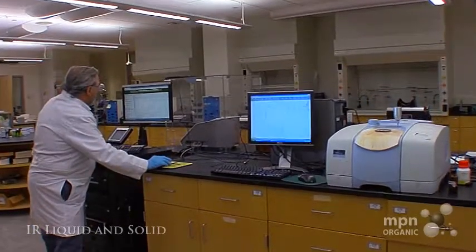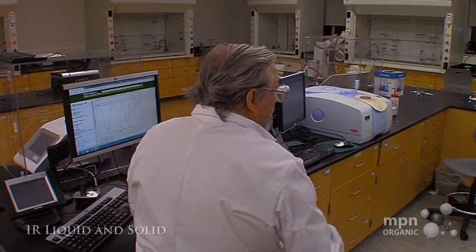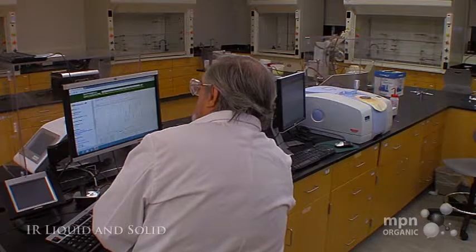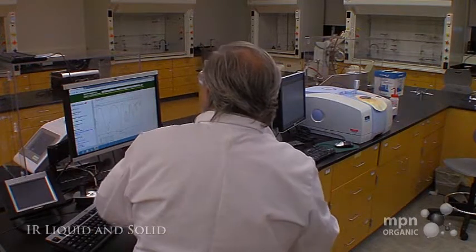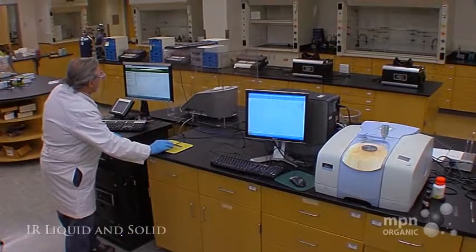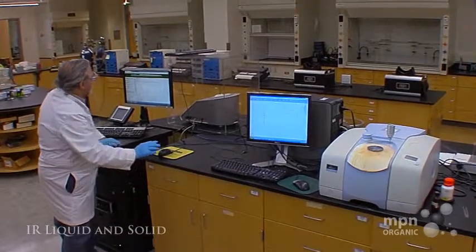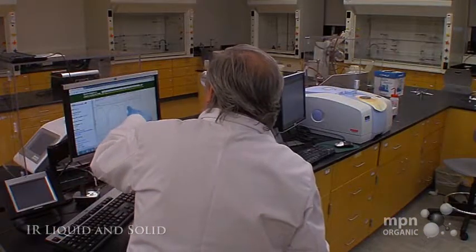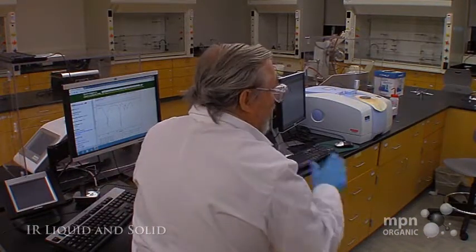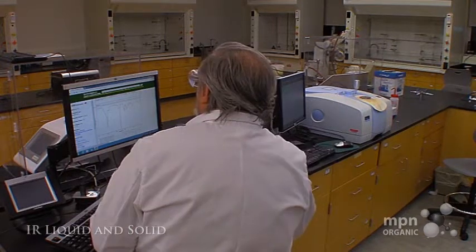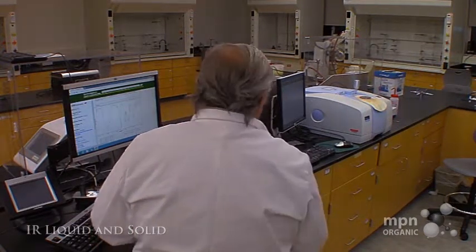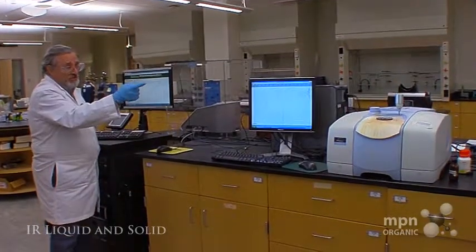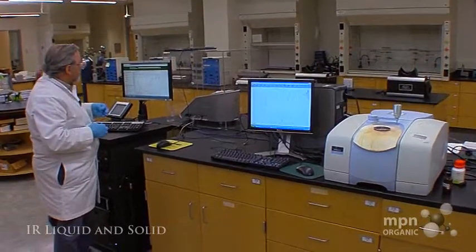And you'll notice along the side here for nonanoic acid that there are several options. In this case, we're interested in the difference between a liquid film and the IR taken in carbon tetrachloride. You'll see that we've got the liquid film up there right now. And that matches very well the infrared spectrum that we took. But when I put it on carbon tetrachloride solution, you can see that it looks a little bit different. And there are reasons for that which we won't go into, but the point now is that you want the liquid film because we're not taking a spectrum in carbon tetrachloride.